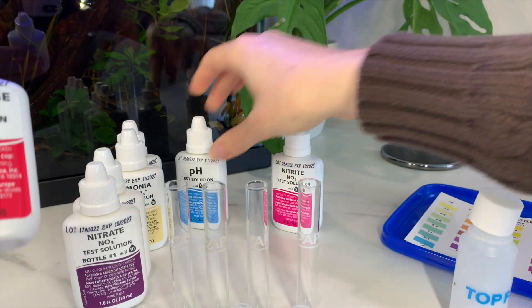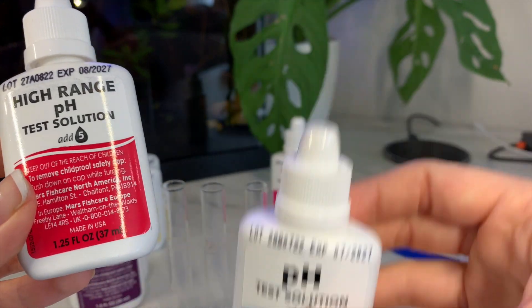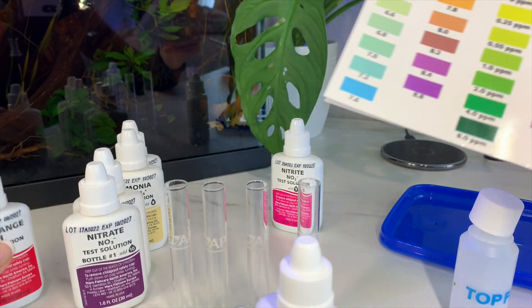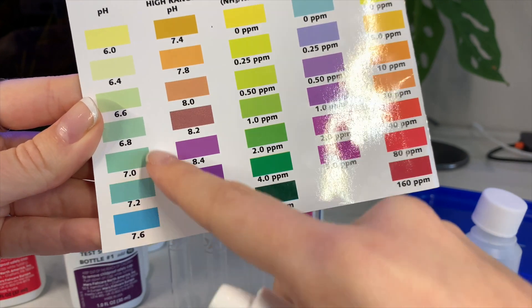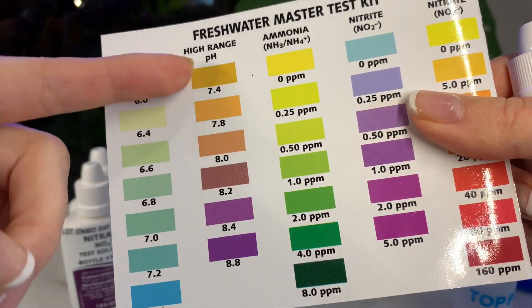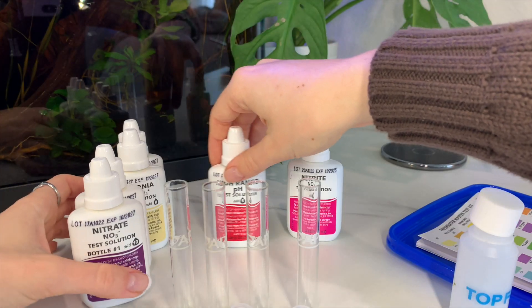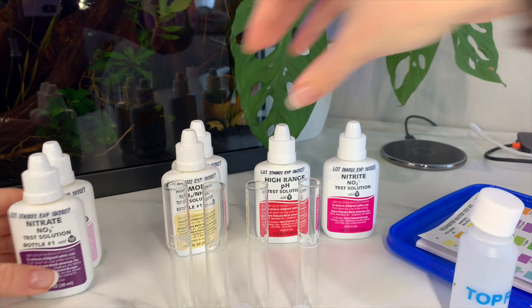For your betta tank you will want to use the high range pH solution. You could use the regular pH, but high range is typically what you're going to want because most betta tanks are going to rest around that area. If you want, use the regular pH first to find out where on the scale you are, and then if it starts to exceed that range use the high range to test further. Typically you want the pH for your betta tank to rest around 7.4.